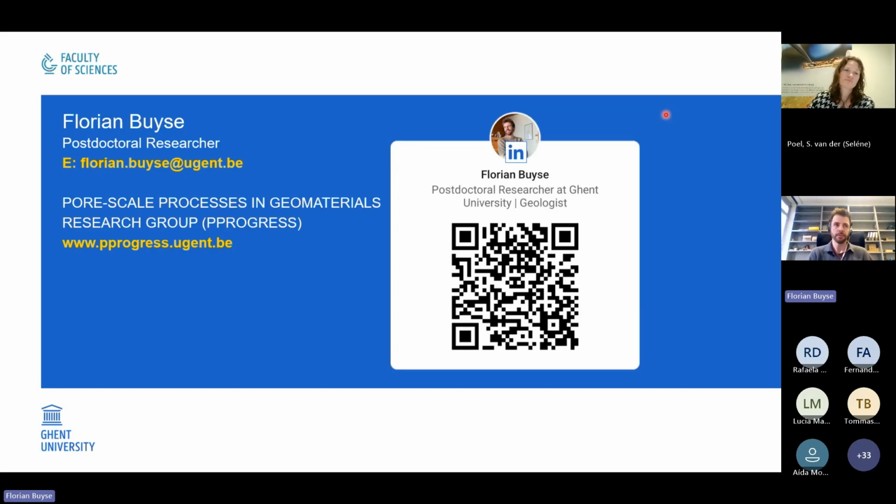But just to say, it is one of the extra things that can be used, but don't limit yourself. If you only have X-ray CT, the standard one, there's already a lot that you can do with it. If you know your materials and your system well, I think it's already a good start for identifying all these minerals.